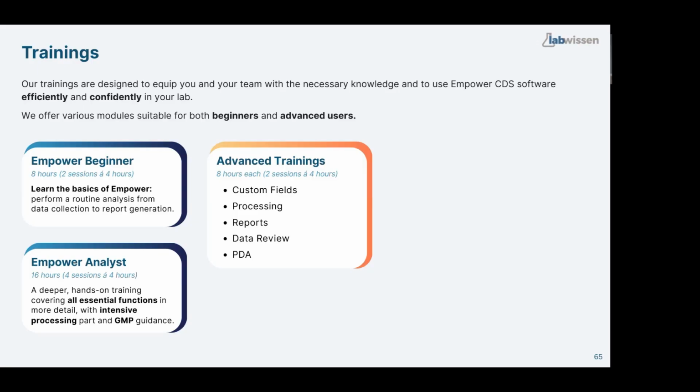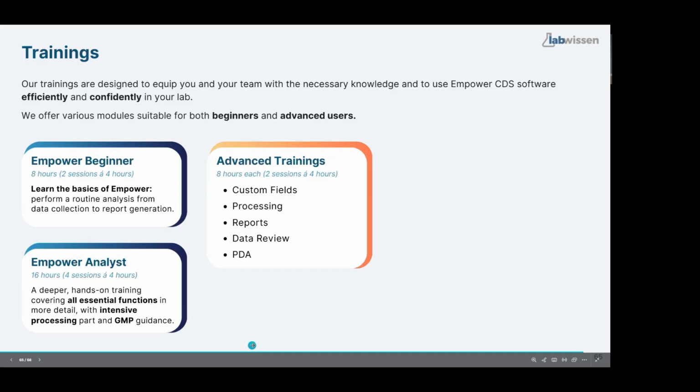Now we have had 2 hours. I tell you truly, when I rehearsed this webinar, because it's the first time I'm doing it, it took me 1 hour 20 minutes. That's why I said, okay, we have plenty of time for the Q&A session. Now I hope you don't mind if we take a bit longer, or you can watch the recording afterwards. We took 2 hours to learn the basics of custom fields, and it's even much more. In the custom fields training, it's really 8 hours, and sometimes I need a bit more because we go through different examples.